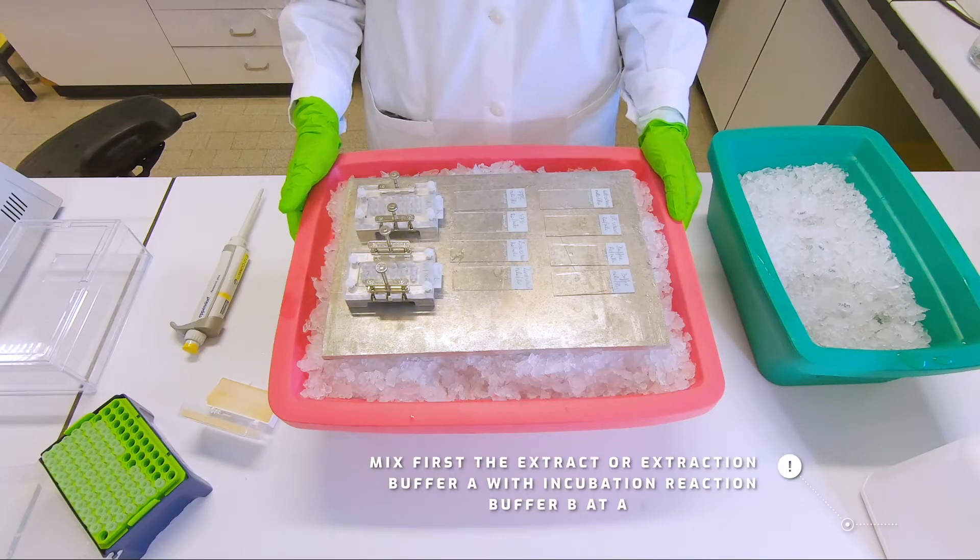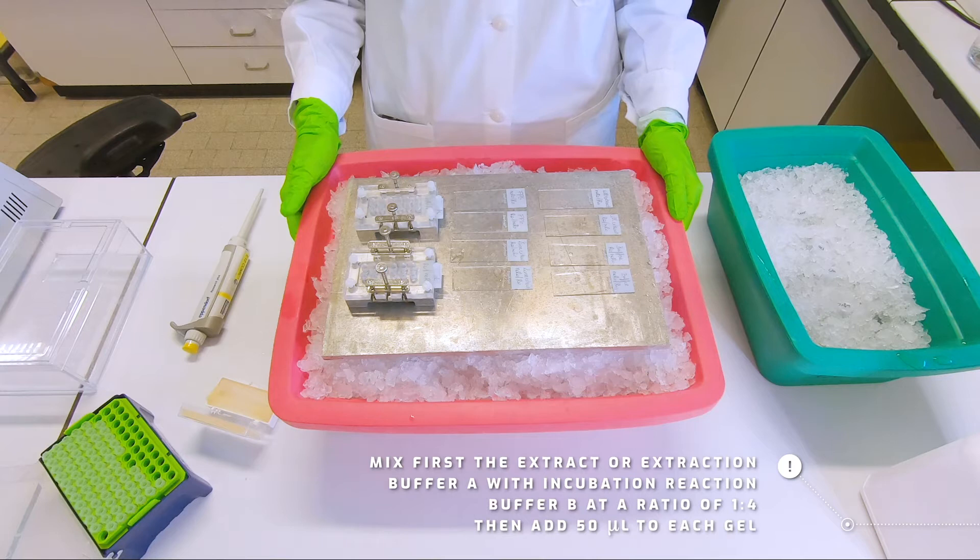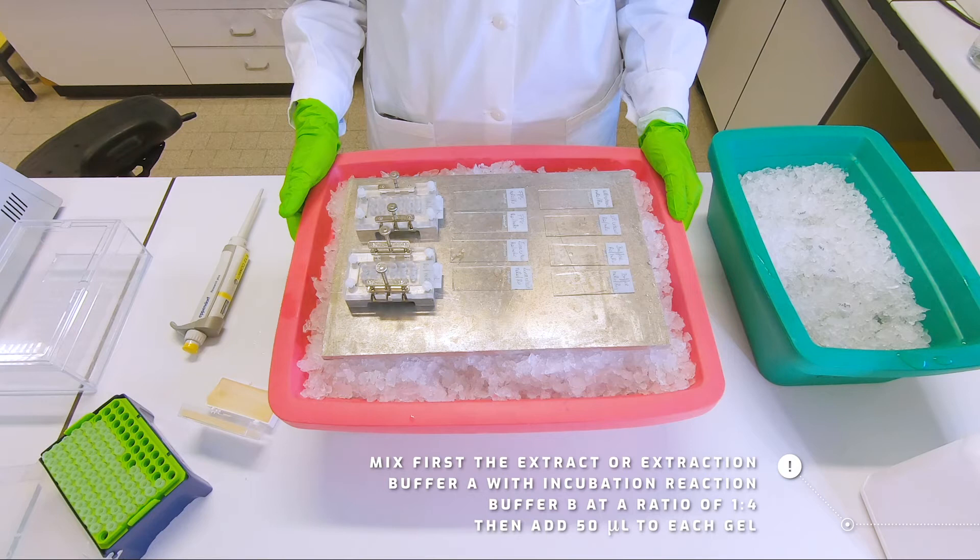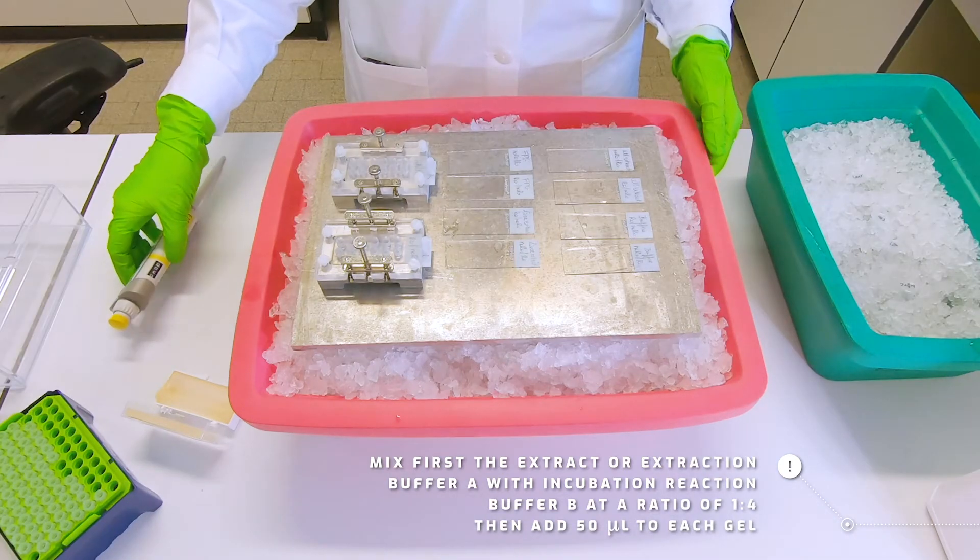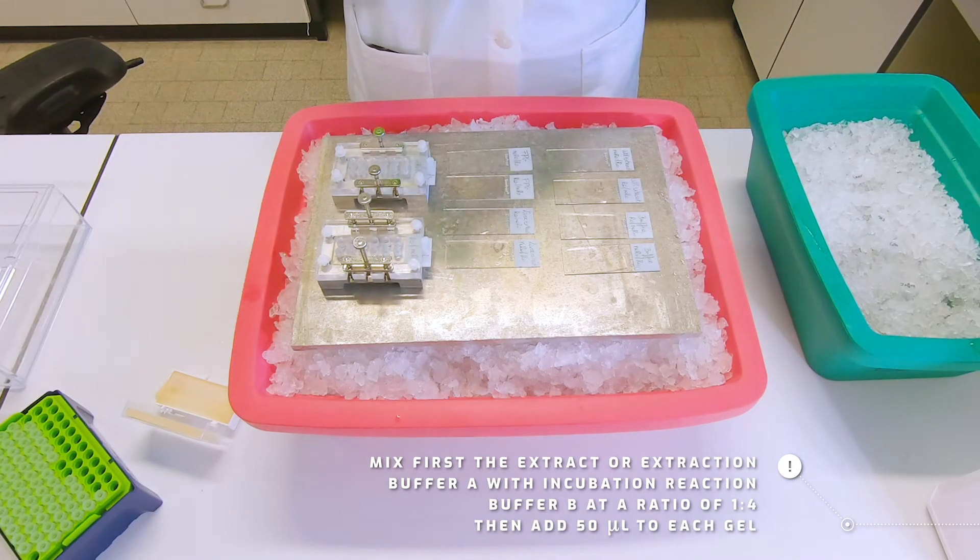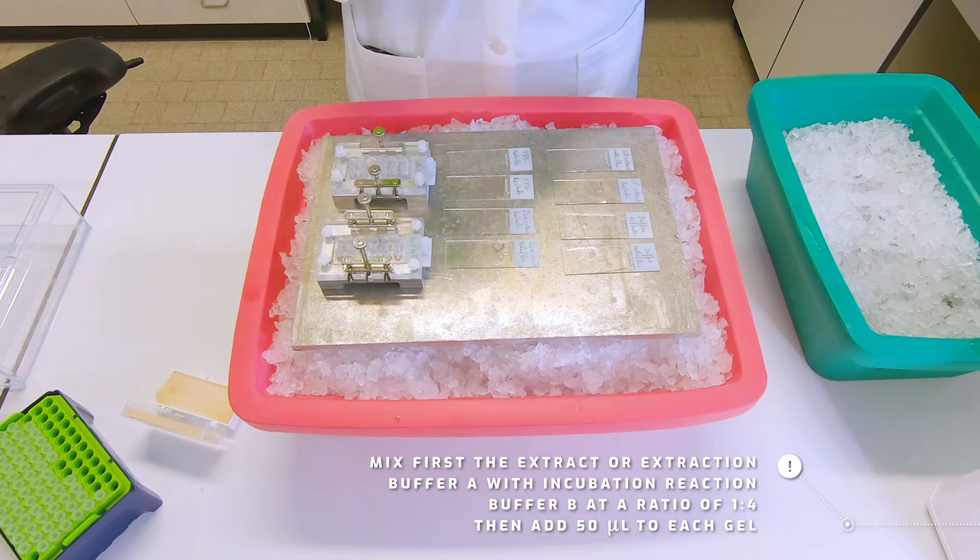Take care to first mix your extract or your control buffer in a ratio of one volume with four volumes of your incubation buffer B, and then from this mixture you add 50 microliters to each gel.